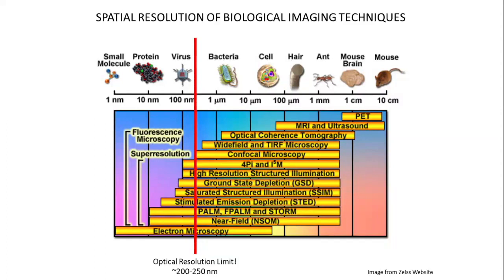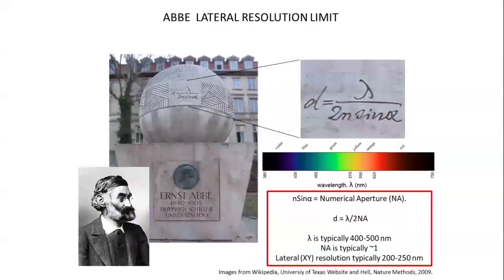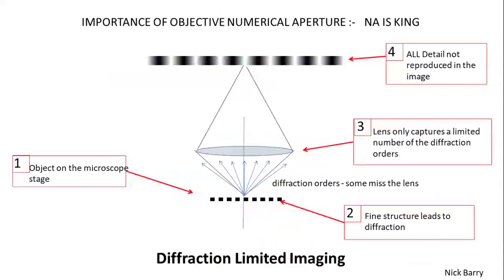Last week we talked a bit about image formation in the microscope and the work of Abbe. He has this formula: the resolution is proportional to the wavelength divided by the numerical aperture of the lens you're using, lambda over 2NA. His argument, just to recap, was that based on the work of Young, we knew that light was a wave phenomenon. Abbe abstracted the object in the microscope down to as if it was some form of diffraction grating. So the fine structure of your object diffracts light.